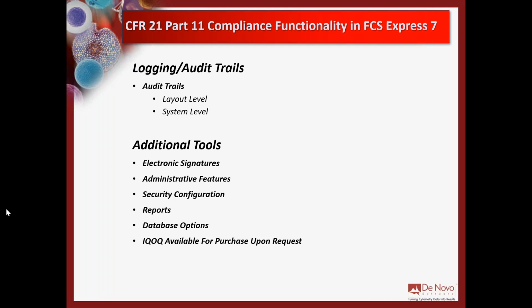So that way, you know if somebody did something in an analysis and then they didn't save that analysis, but they printed it out, and that way you have a record of tracking all of that. And it's a very important functionality that's been suggested to us and worked on by a number of our clients. So we do have some faith that it's going to be applicable to a number of different folks.